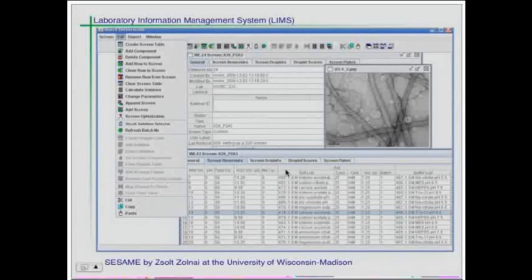And we were using their screen to see whether we could improve our 2D crystallization success rate. So each of those conditions will now have images associated with it. So we manage the entire system this way because we've done around 50 different screens this year, 50 screens, 100 conditions each, so we have about 5,000 grids to evaluate, so that really multiplies into thousands of images.